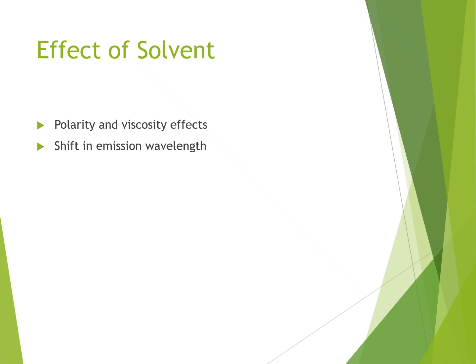The solvent itself should not give emission light, or interfere with the emitted wavelength, so one should be very careful while selecting the solvent when studying fluorescence spectroscopy.